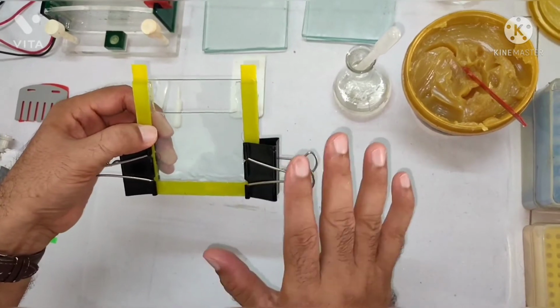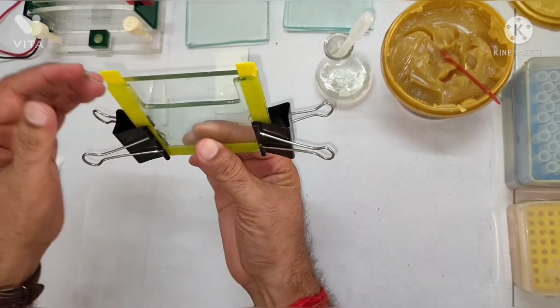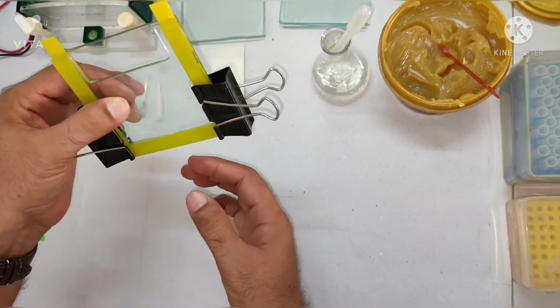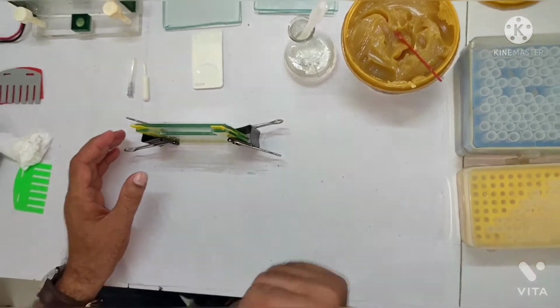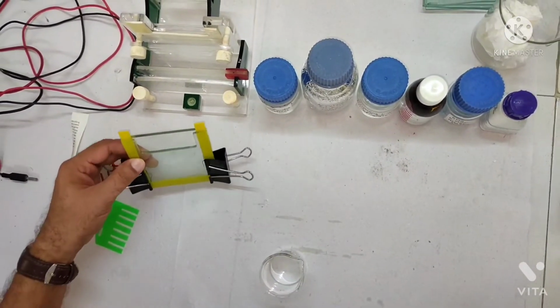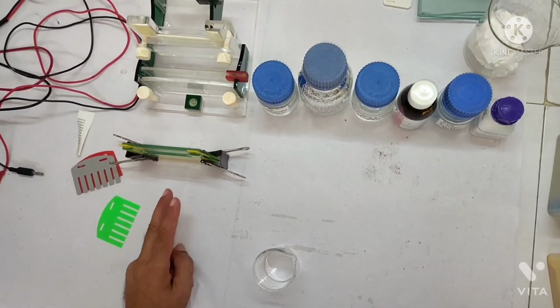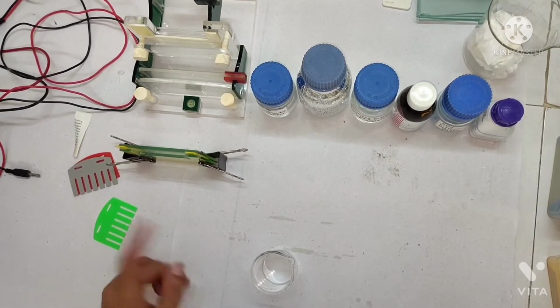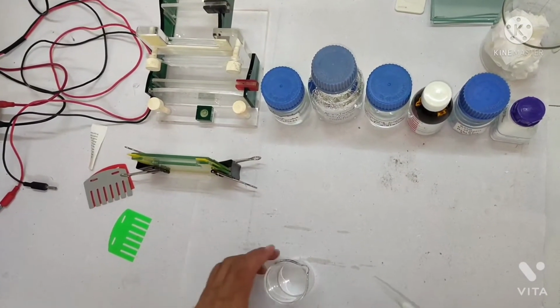See, now you can check by putting water in between the plate also, and you can check the leakage, right? But if you are confident, then there is no need to check the leakage. So now our plate is ready. So now we have to cast the gel, right? So for casting gel, we have two different kinds of gels here. One is separating and another is stacking gel. So first of all, we should cast the separating gel, right?